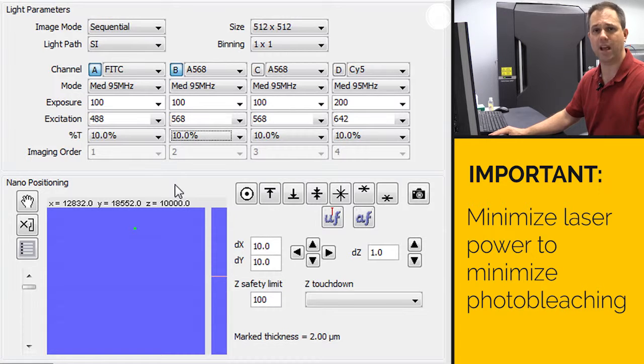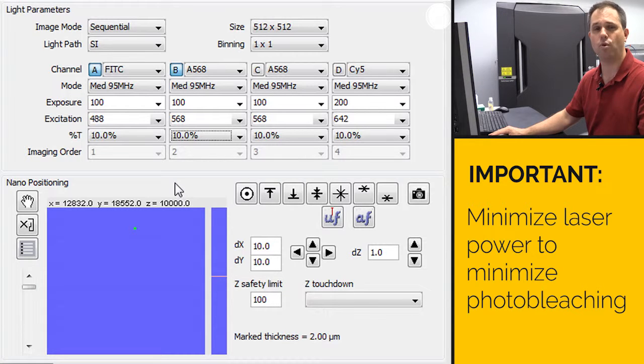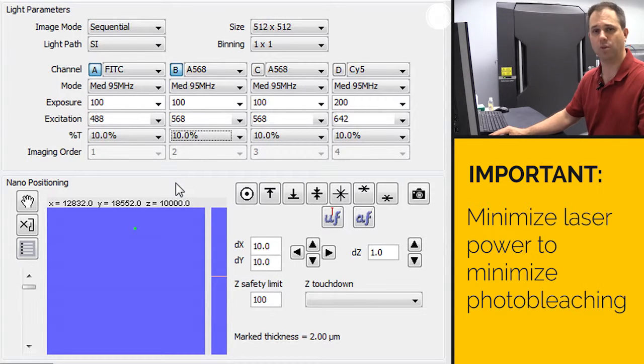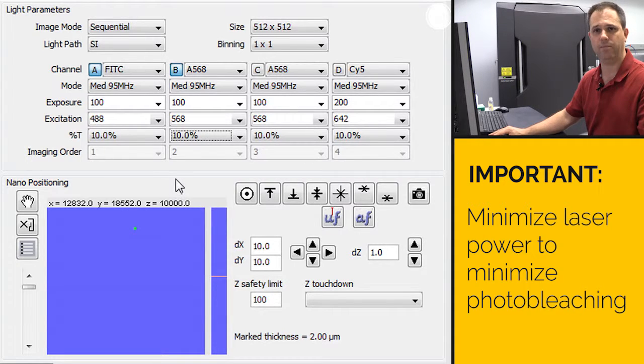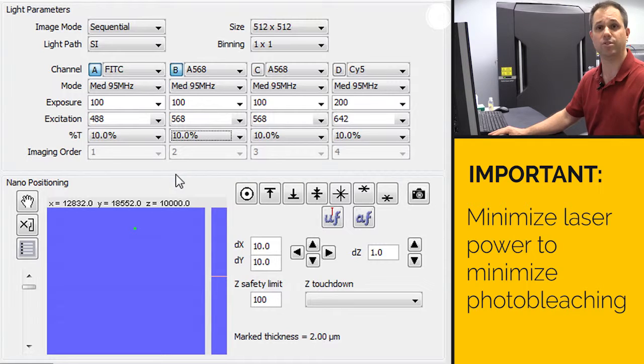Photobleaching of your sample is going to result in very poor reconstruction later on. So you really want to try to minimize this 10% or less if possible. So we'll set both of those to 10%. Those are the setups for your initial settings.